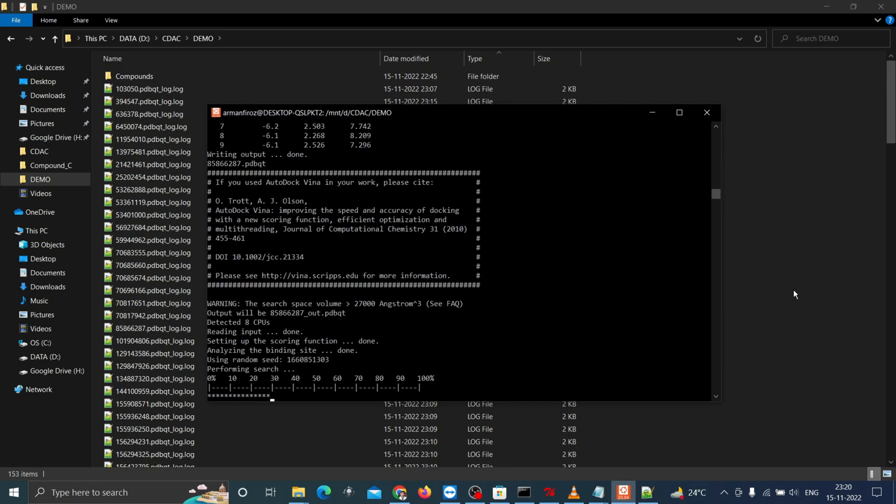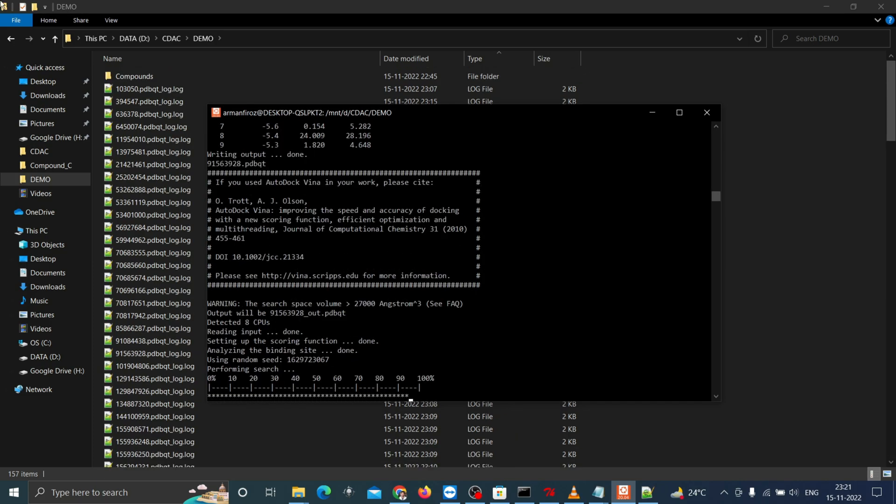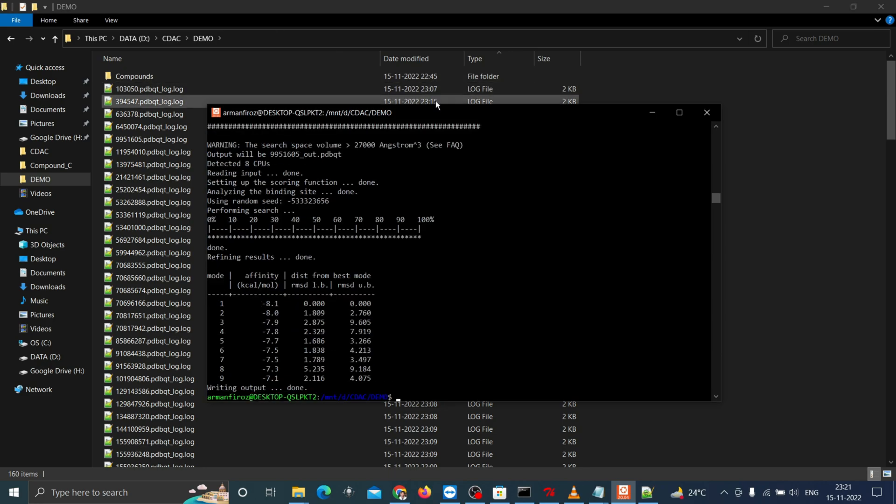As we have 51 compounds, it may take some time to finish the docking process. Now the process is done.